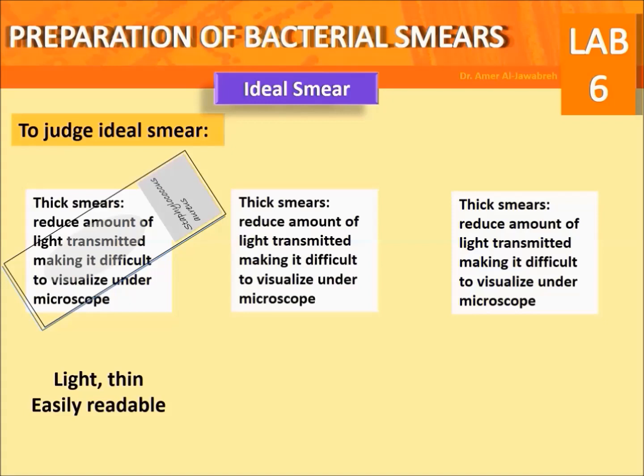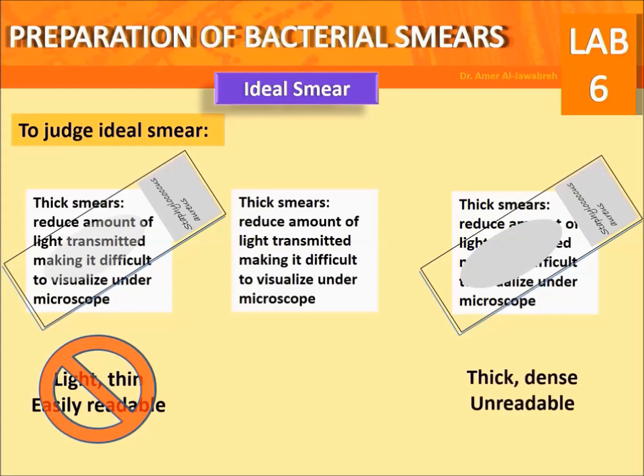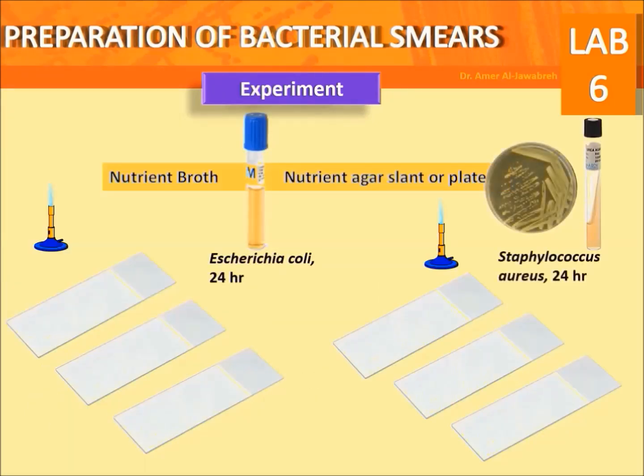Evaluating the ideal smear: evaluate the hazy film on the slide. A smear through which a printed script is easily read is considered too light and thin, and therefore unsuitable. If the script is completely unreadable, the smear should be discarded. The ideal smear has a hazy film through which the script is to some extent readable.